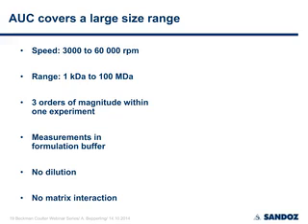You can analyze your samples in nearly any formulation buffer. So far, I encountered no system, and we have really nasty formulations from a spectroscopic perspective sometimes, which cannot be analyzed by either interference or absorbance optics. You may not have to dilute your sample. Of course, you should if you want to precisely measure aggregate content, but you may have a look at the undiluted formulation. And of course, the main advantage is you do not have matrix interaction.